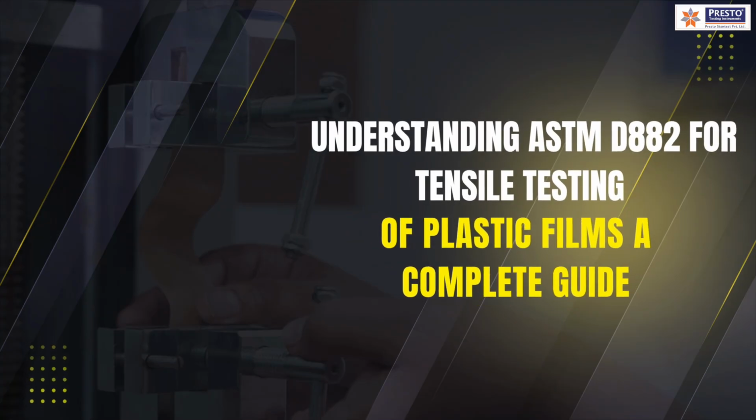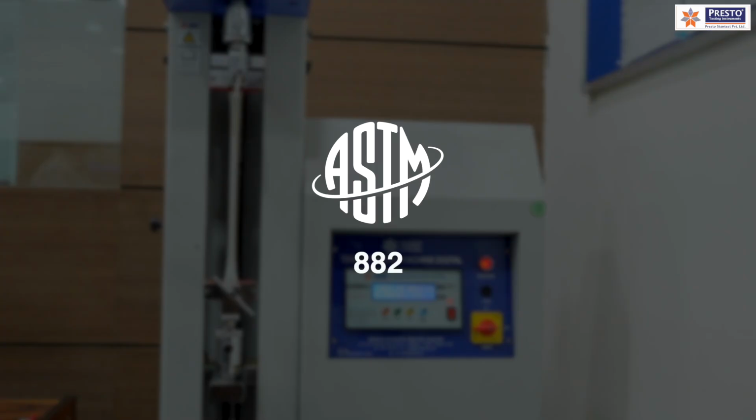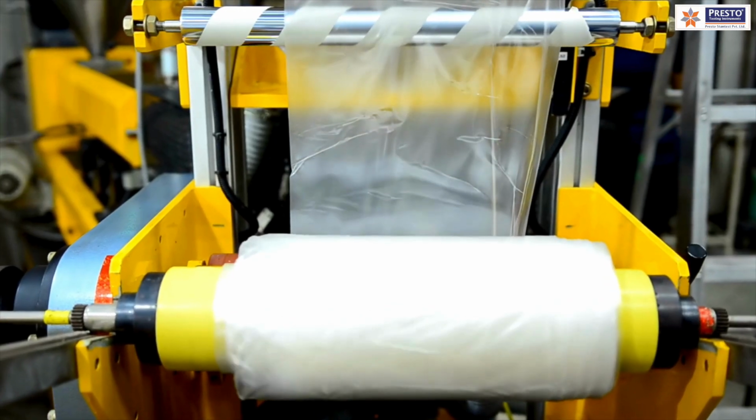So, hello everyone. The purpose of this video today is to make an understanding of the ASTM D882 for tensile testing of plastics, mainly the plastic films.